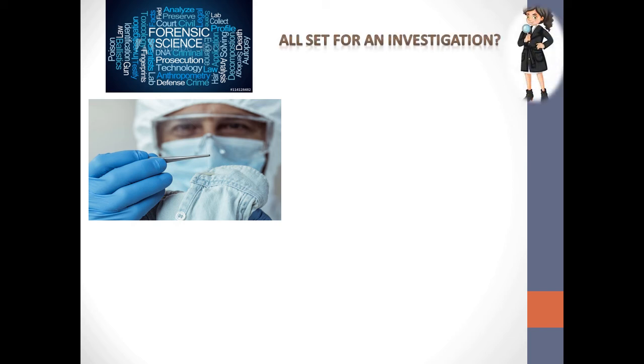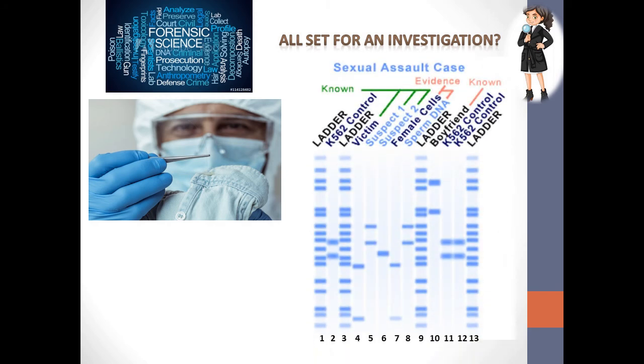Having understood how RFLPs can be used in forensic science and in DNA fingerprinting, are you therefore all set for an investigation? Don your detective cloaks and pick up your magnifying glasses. Let's investigate a sexual assault case using RFLP.